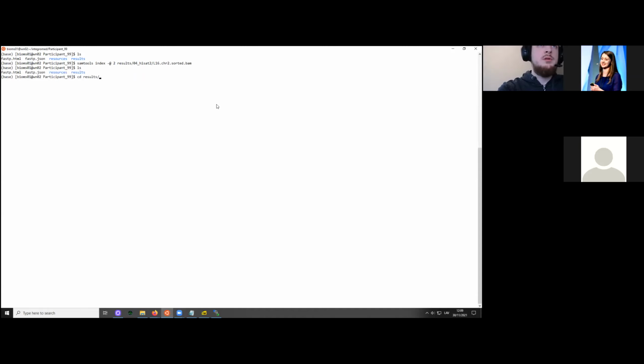So quickly let's check, and we can see that we have a BAM file and we have a BAI file, and the BAI means that it has been indexed.